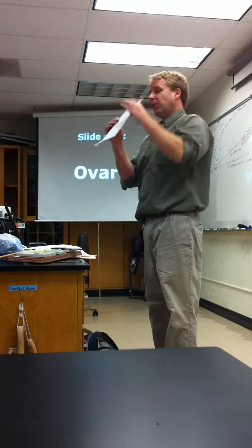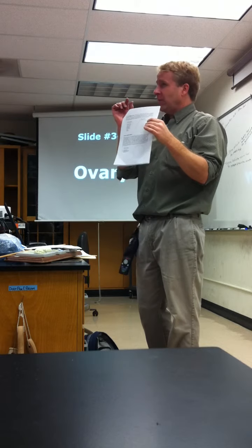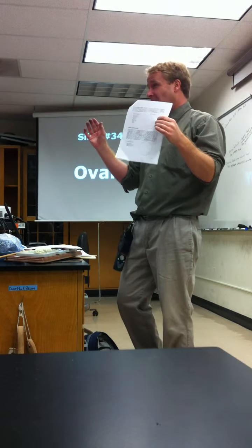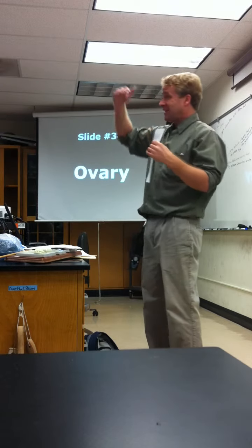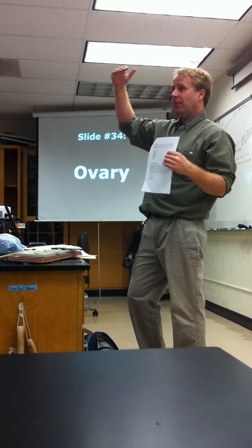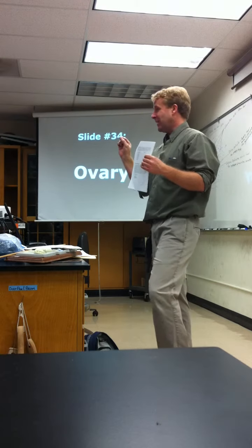is because the mature follicle is actually hard to define. It's hard to really tell the difference. Is it a big secondary follicle or is it a mature follicle? If I were a mature follicle, I'd actually like to see it near the germinal epithelium. And so our textbook and our histo book actually used to contradict.